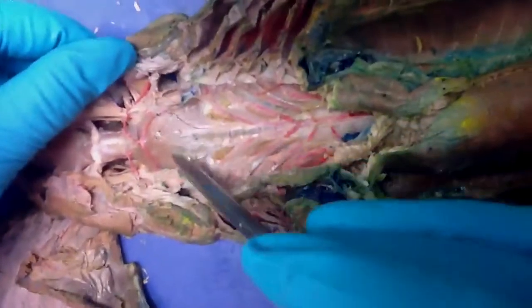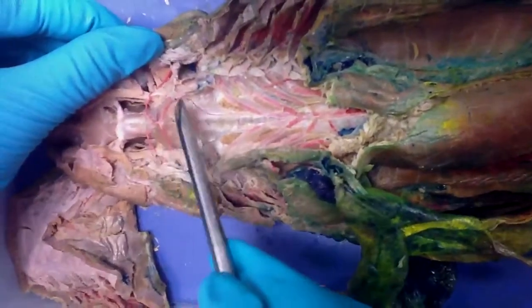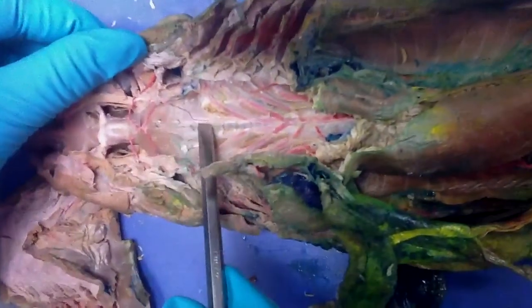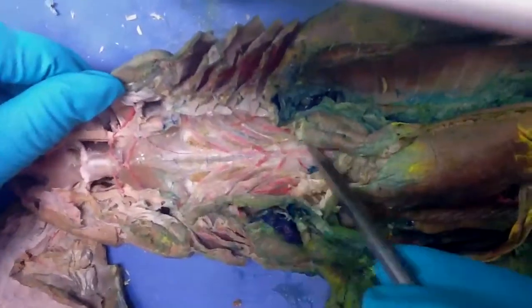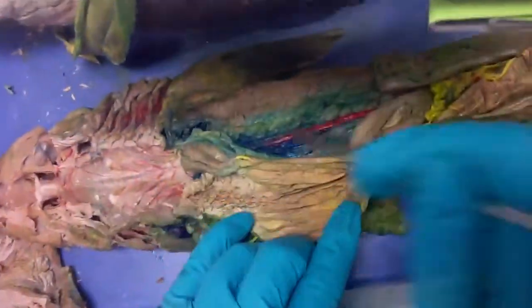Yep, supplies the hole. And so we've really just got the internal carotids, the carotid foramen, and then the paired dorsal aorta, which you can't even see the other one, and then all the efferent branches, and then the collector loops that go through the gills. And that's the arterial system, other than the dorsal aorta.